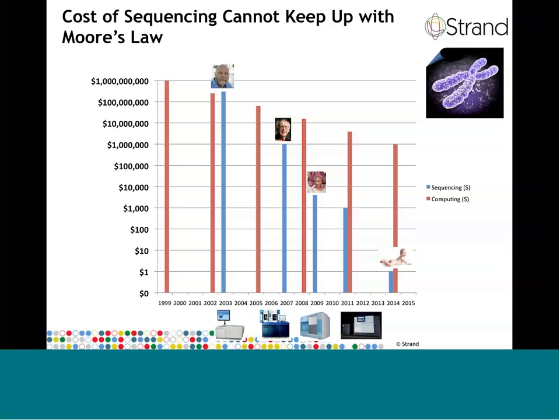The cost of sequencing has completely outpaced the cost of computing, represented by the famous Moore's Law, displayed here as well. But all these costs pale in comparison with the cost that is introduced when it comes down to analyzing the result of sequencing experiments.